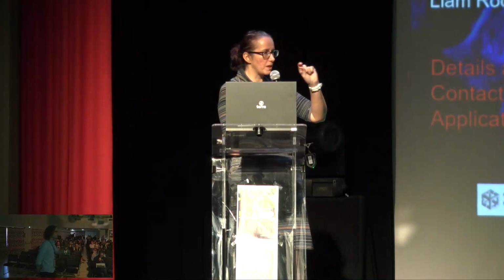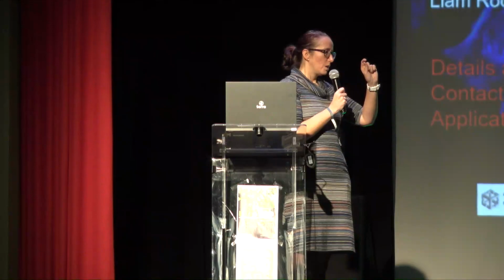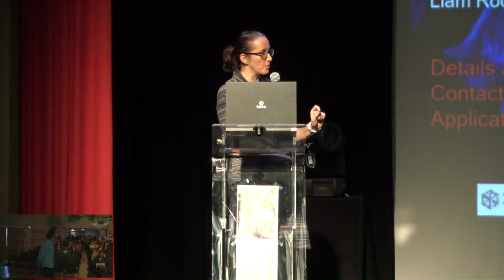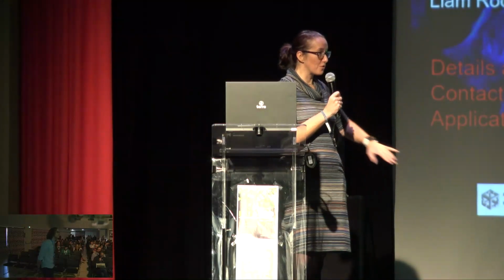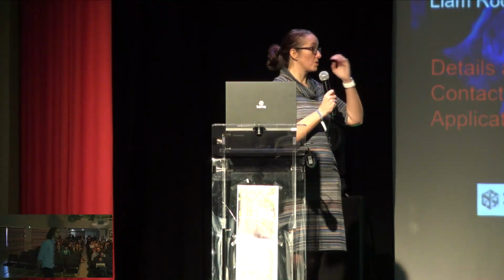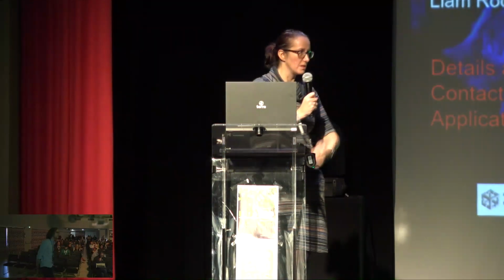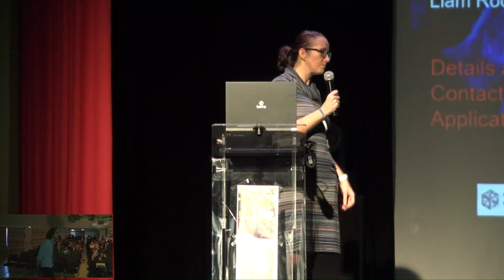The other thing is that because we have such a small depth of field for the Mesolens, so it's 7 micron, we don't pick up the subsidiary beamlets in the axial direction. So we don't need to perform any post-acquisition deconvolution to remove those from the data set, because we only detect that first order, or 0th order, I should say. That simplifies things enormously, because then you can immediately use your data set rather than having to work with tens or hundreds of gigabytes to process it before you can analyse it.